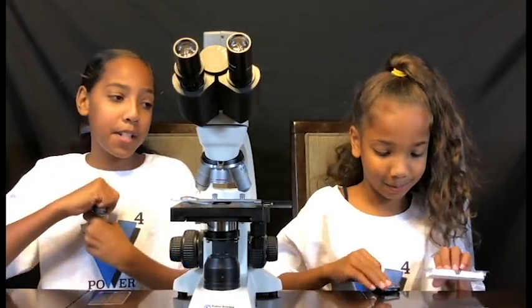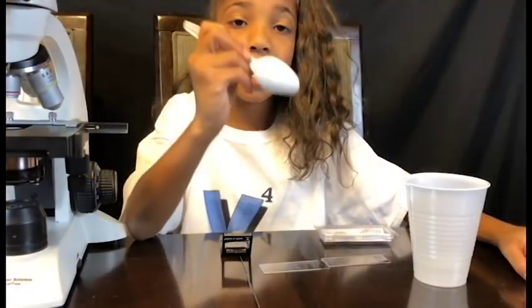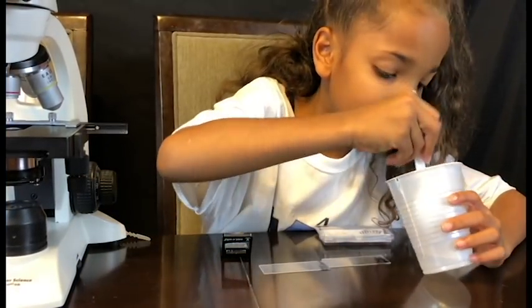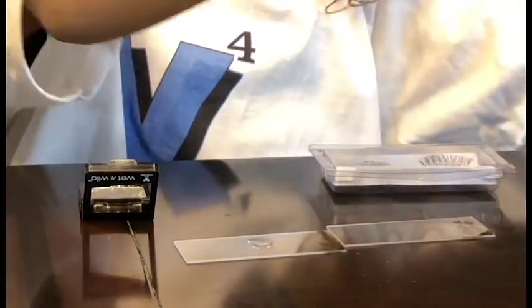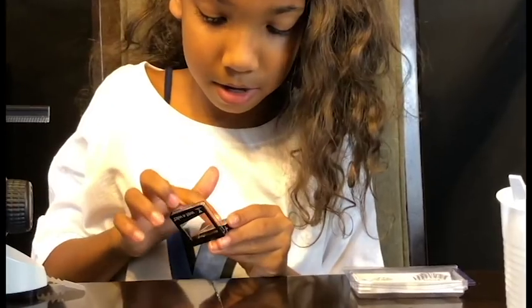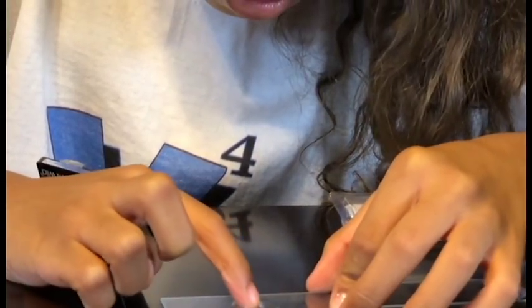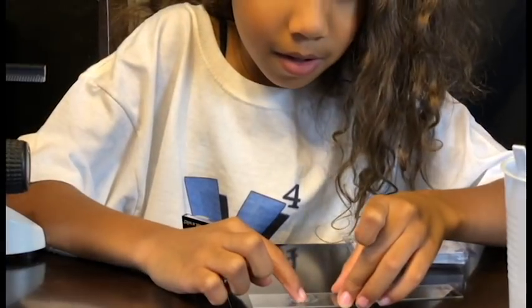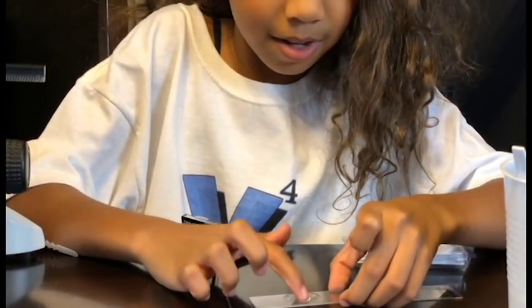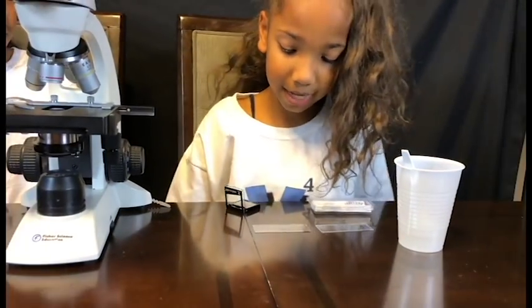Now we're gonna be putting them onto the slides, but Janiyah needs some water to make a smear because the face glitter is dry. I'm gonna use the spoon to get some water. Now I'm gonna rub the glitter on it a little bit more. Okay, I'm done. I can't really lift it up this time because it has water on it.